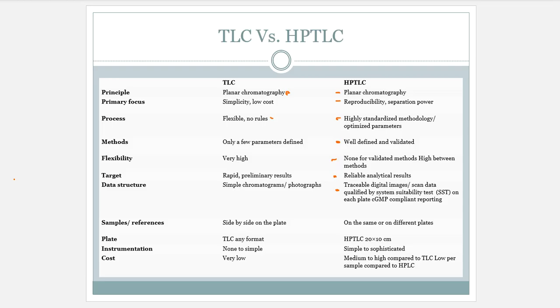Samples and references here, it says they have to be side by side on the plate. On the instrumentation side, it says on the same or different plates. Oh, no, don't tell me this. It's not true. A good rule of thumb is to still apply standards and samples onto the same plate.